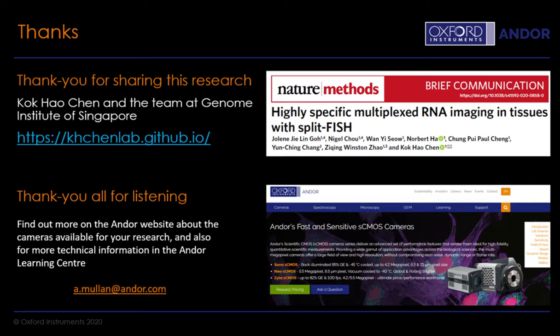Thank you for the question. Actually, it ties in nicely with the Andor talk as well. One of the factors that contributes to how long the assay takes is how large a field of view we want to image. For example, in these tissue images where we look at 1 to 2 millimeters square of area, it could take up to half a day of imaging and washing and re-imaging to cycle through all this field of view.